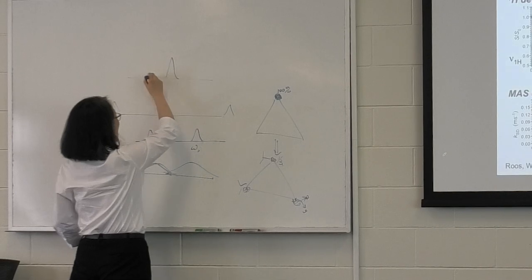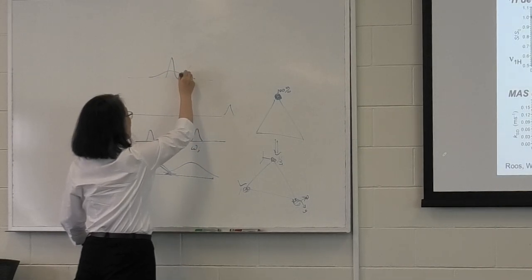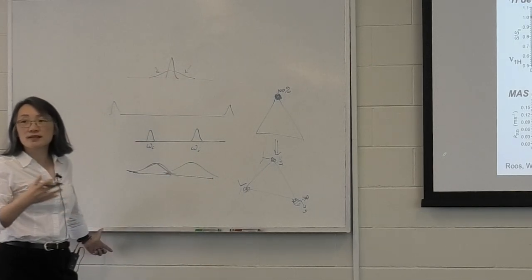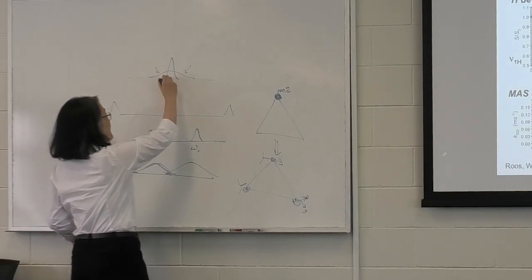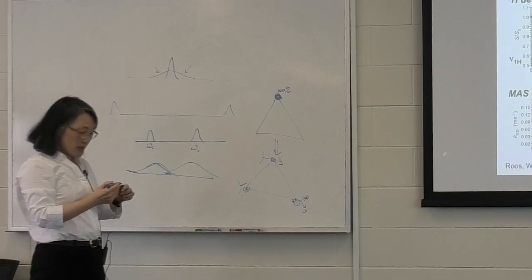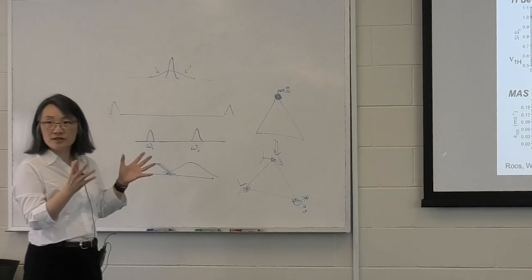So if you are not doing any proton irradiation at all, you would have a pattern that's broad. So you can actually cover the CSA anisotropic spin exchange. If you start to irradiate, you're basically making the single peak sharper. And so it's not going to be as effective in doing the anisotropic spin exchange.